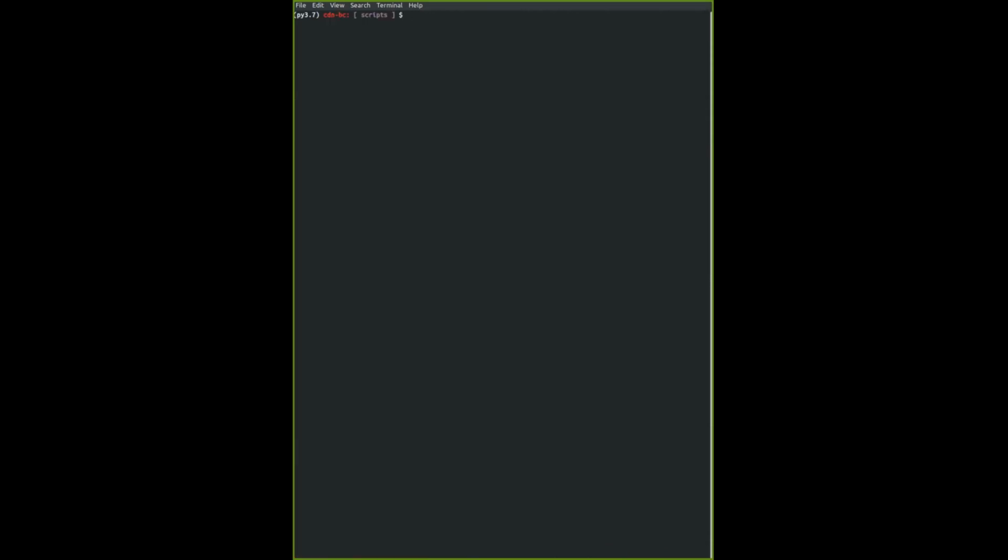Now let's see what the output looks like. If you remember, we created a new output file called FastQC outputs. I'm going to quickly ls that folder and show you what we have in there. RNA_seq workshop, followed by outputs, followed by FastQC, like this. All right. You can see there are 4 files, sets of 2 files for each experiment.